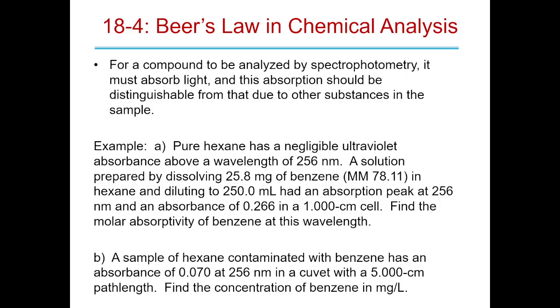If you were to take the full spectrum, you would see that some peaks are shoulders on other peaks. And this could be a shoulder on something else that you're taking, and then you won't get a nice change due to that peak, right? It'll be to whatever it's a shoulder on. Does everybody understand what I'm saying about a shoulder? It looks like your head and shoulders. So you have a bigger peak, and then you pick the smaller peak that's on it.